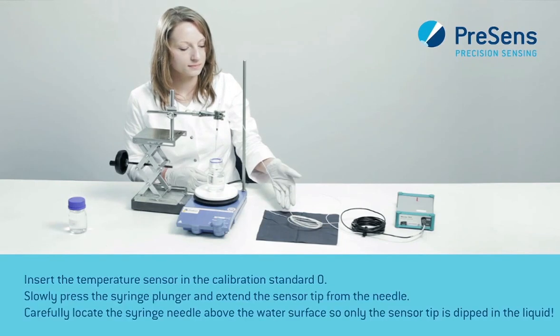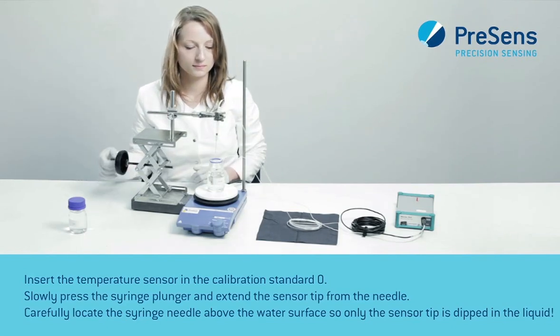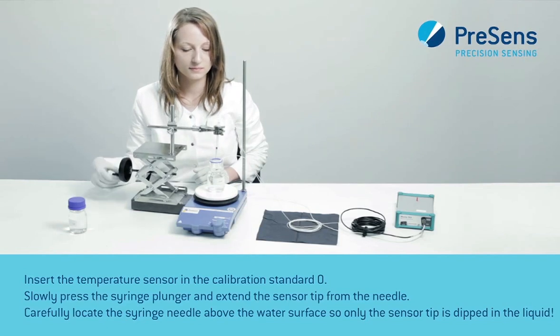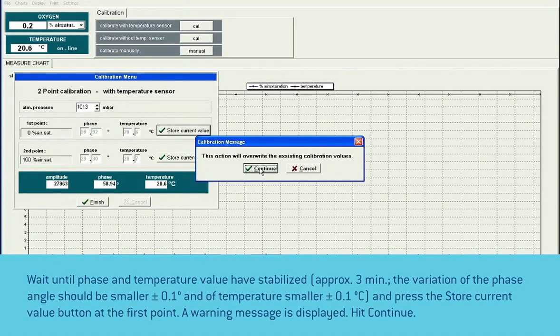Insert the temperature sensor in the calibration standard 0. Slowly press the syringe plunger and extend the sensor tip from the needle. Carefully locate the syringe needle above the water surface so only the sensor tip is dipped in the liquid. Wait for about 3 minutes until phase and temperature value have stabilized and press the store current value button at the first point.